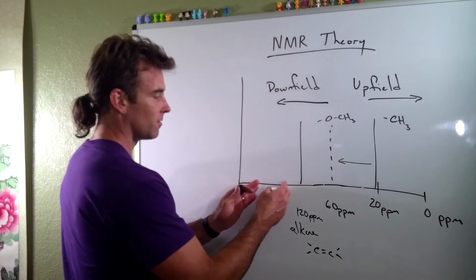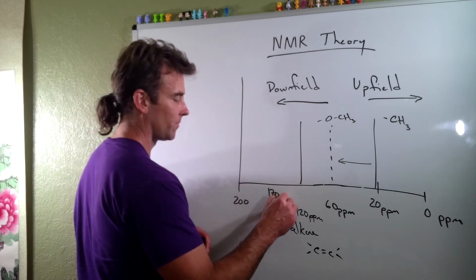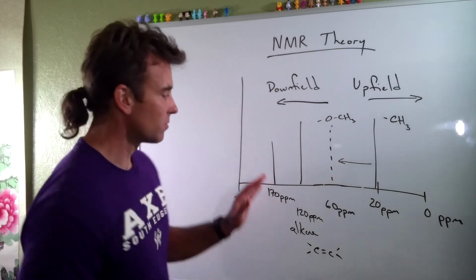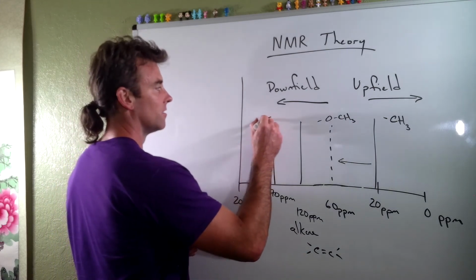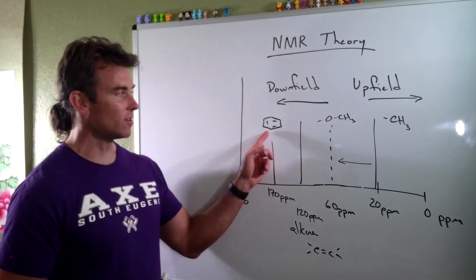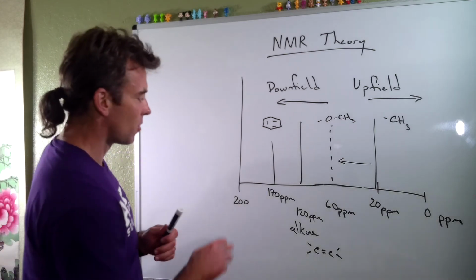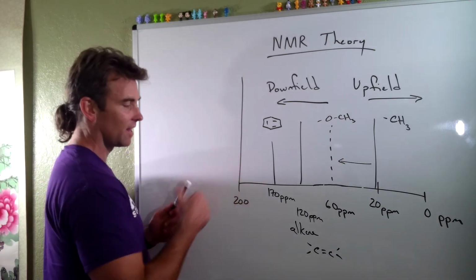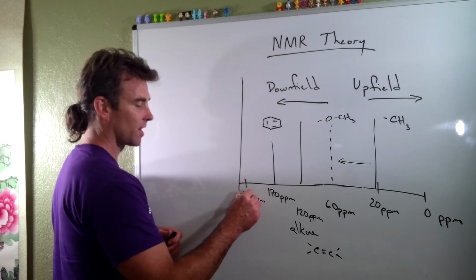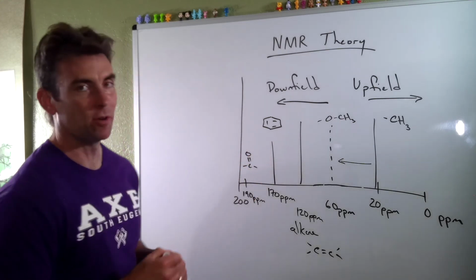This particular region right here, let's say around 170 ppm, if we see peaks here, and by the way, usually there's a whole bunch of them, that's what's called the aromatic carbon area. So we're automatically assuming that whatever carbons are here are somehow associated with a benzene ring. And another really important area out near 200, let's say like 190, and again, this all depends on the exact group you're talking about, is where there's some sort of carbonyl very likely.